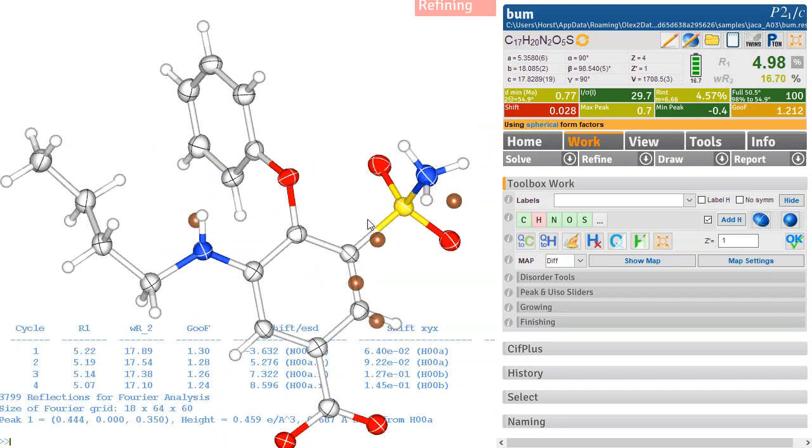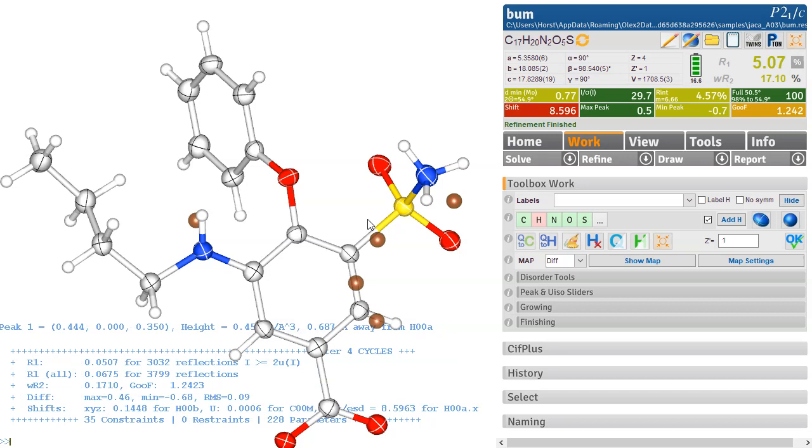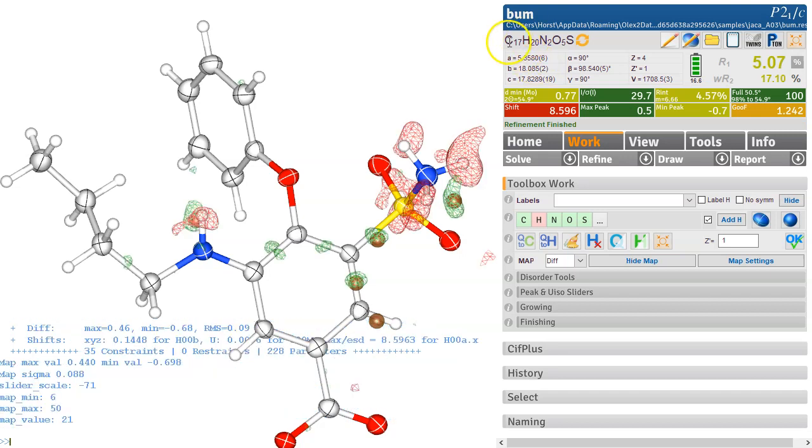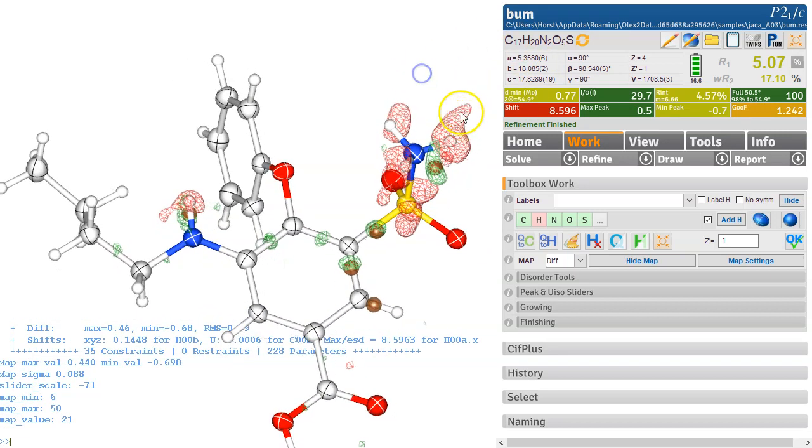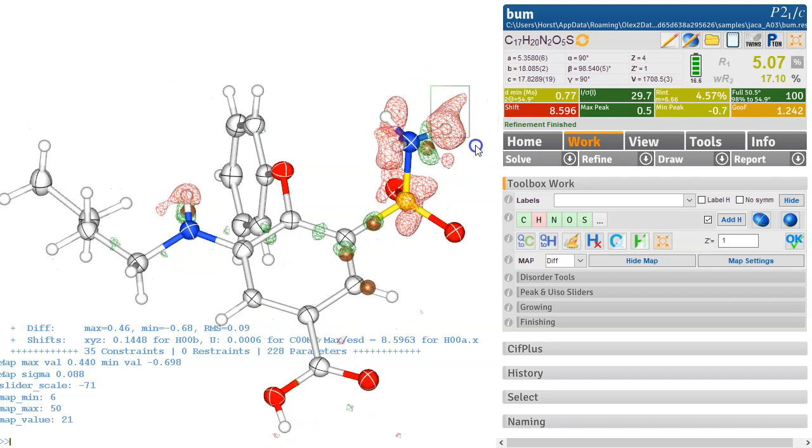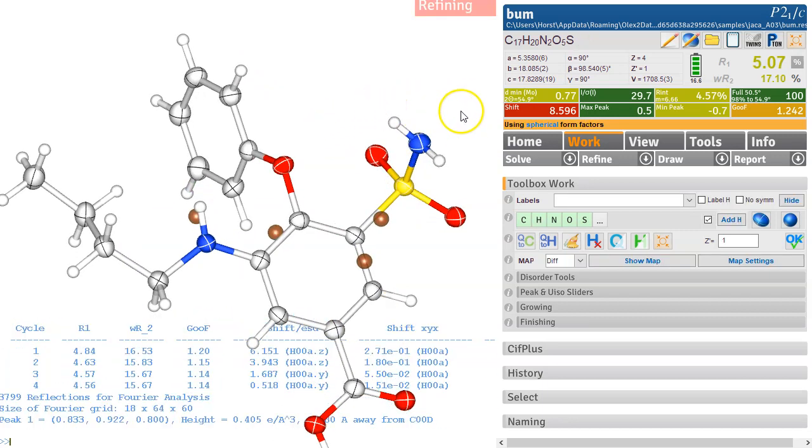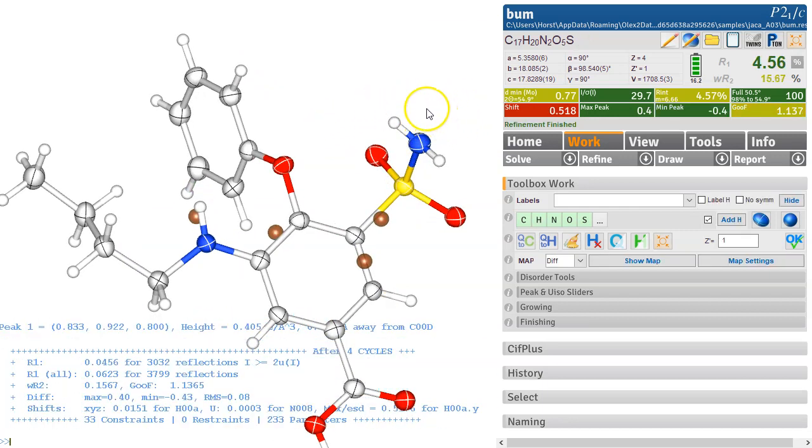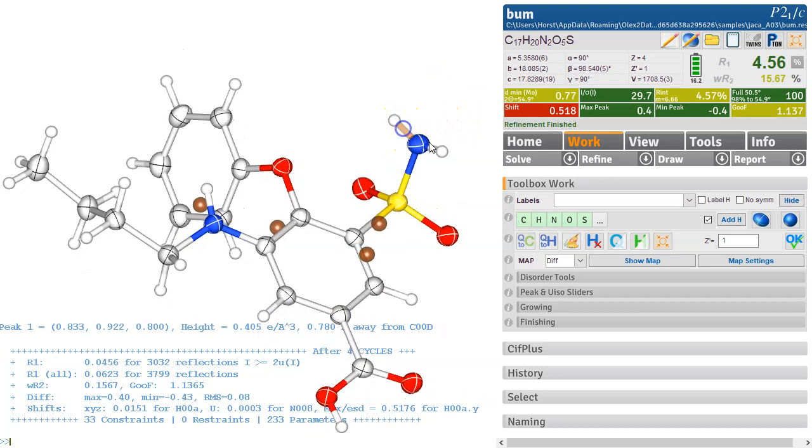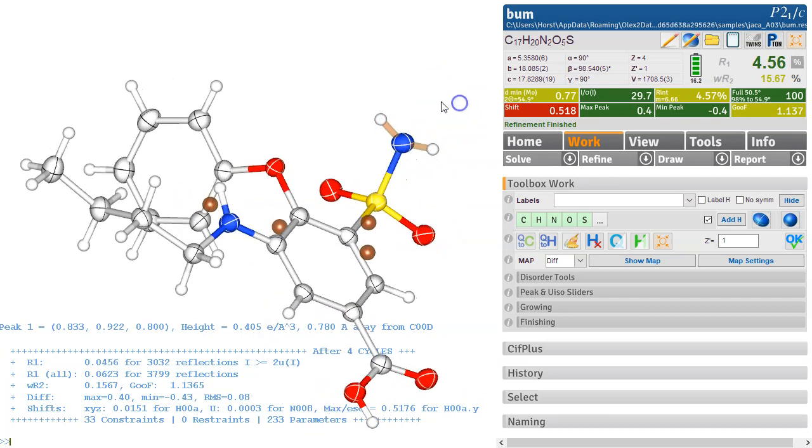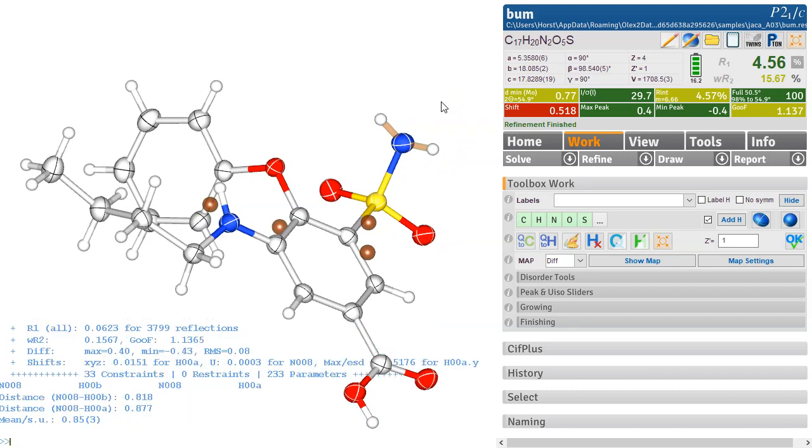So OlexT doesn't get it right. It doesn't think there's two, there's three. So Control M now, we can see the wrong one. So this is the hydrogen, is now the red one. So we can just draw shift in the left mouse, this rectangle and then refine this. The problem is that now the restraints, so the constrained hydrogens are probably no longer taken. So if I go Sel minus L, I select the two bonds, Sel minus L, I can see the distances are quite different.